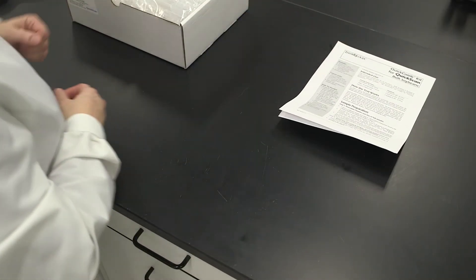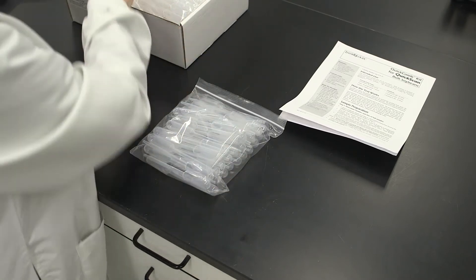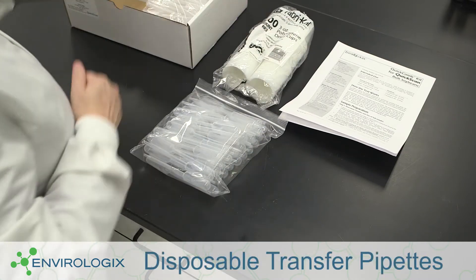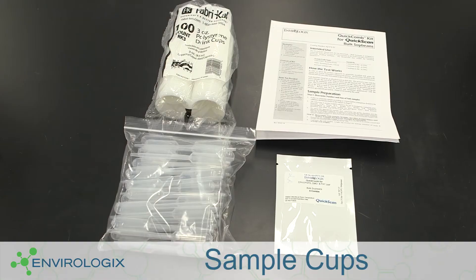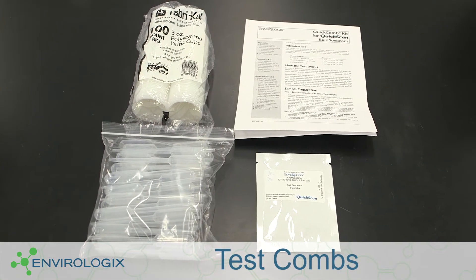When unpacking your GMO quick comb kit for quick scan, please check to ensure that all the listed components are present. Your kit should include a product insert, disposable transfer pipettes, sample cups, and soy GMO test combs, which will be packaged in either a packet or a canister.